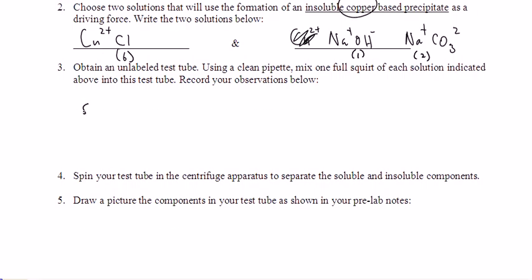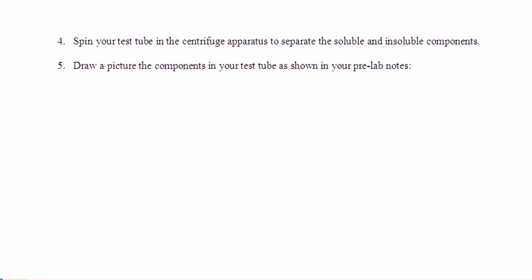You should have seen some sort of goopy, insoluble precipitate being formed. You're going to draw a picture of it below, and you're going to label the components.